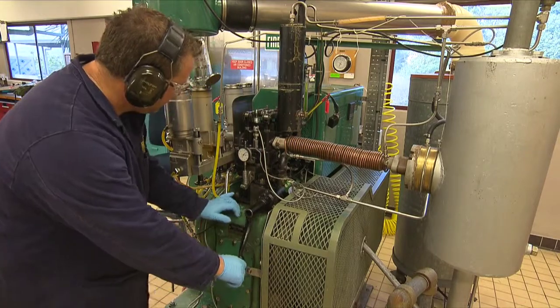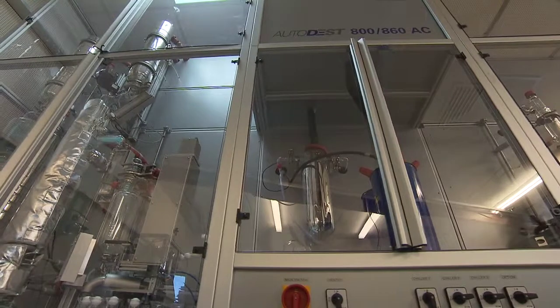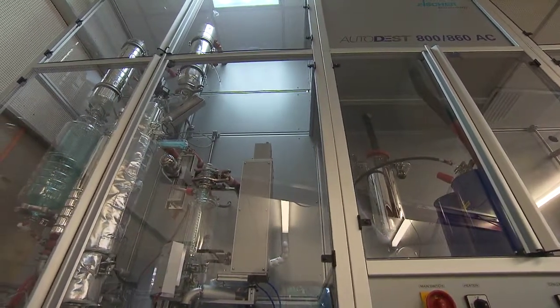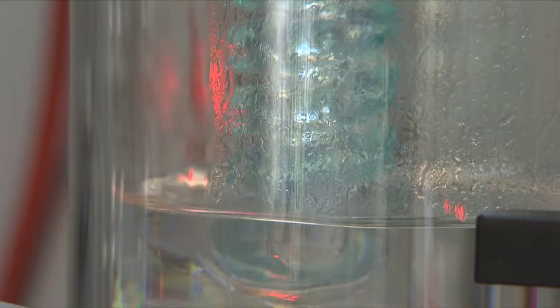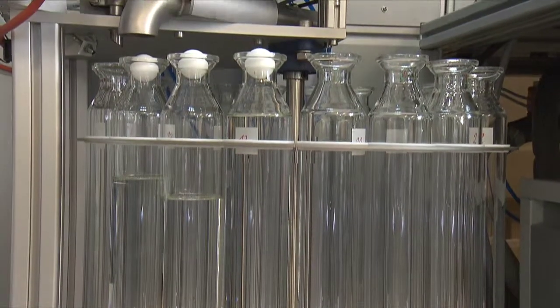And finally, at the end of the fuels lab, we can find our crude assay equipment that helps us support the oil and gas industry and refineries. Crude assays are like little mini refineries that enable us to determine the unique characteristics of crude by physical distillation whilst retaining the cuts for further physical and chemical analysis if required.